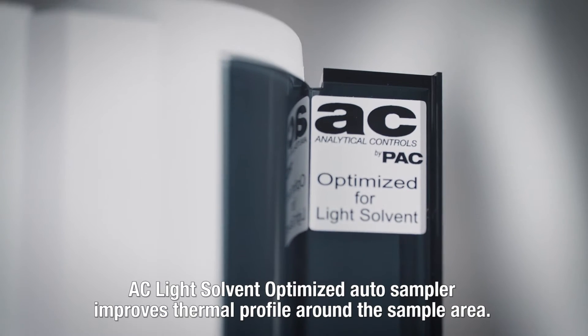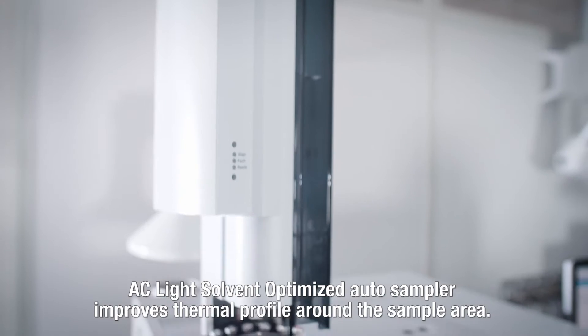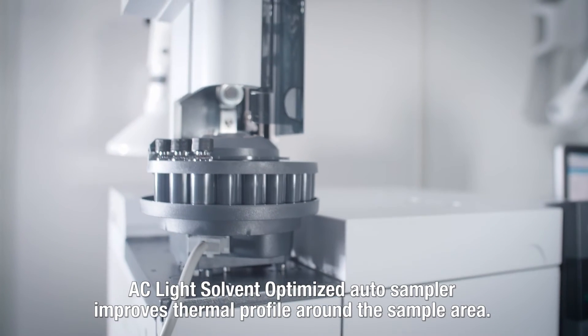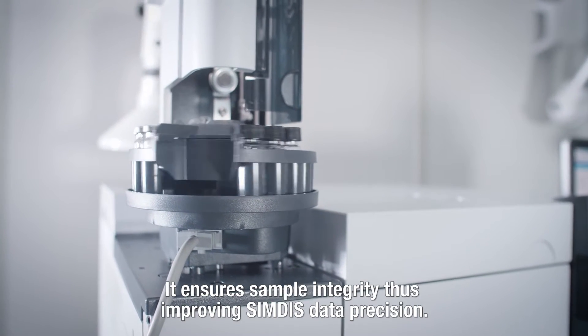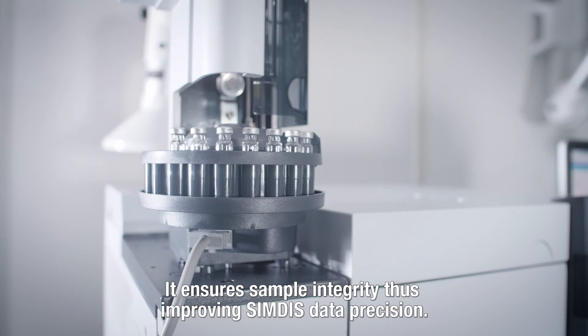AC light solvent optimized auto sampler improves thermal profile around the sample area. It ensures sample integrity, thus improving SIMDIS data precision.